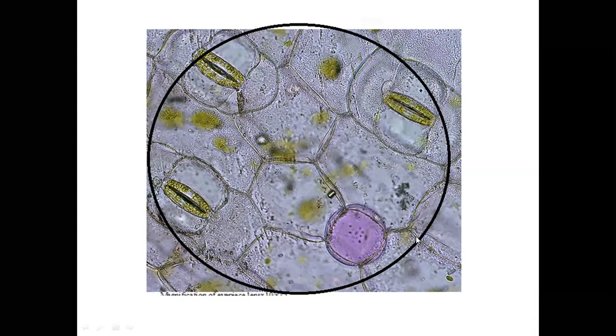In fact, if you may count together, the same slide, I change the color here, you can see 1, 2, 3. So we have moved from 15 to only 3 stomata. That is how it can have implications. The magnification that you use can have that serious implication.